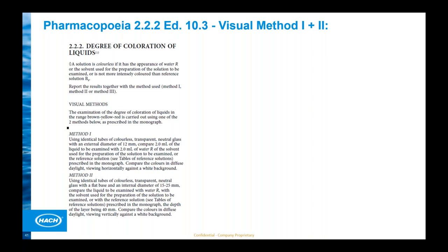Okay. Thank you. And then we have one last question here. So for the lab system, for the LEQOs, what delta between two colors could be considered equal? So Ralf was describing this earlier. What color comparison delta could be considered as equal? It depends.